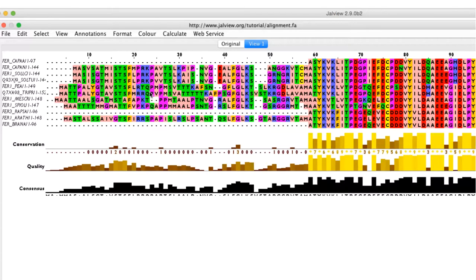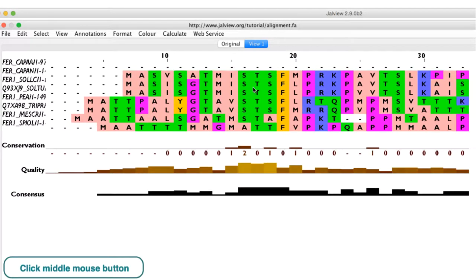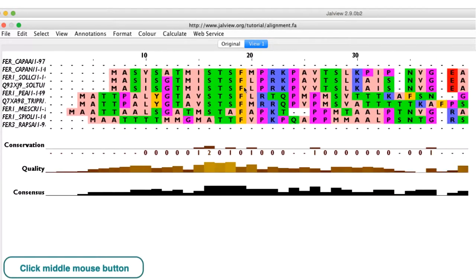A rapid way to change the font size and layout is to click the middle button and drag it across the alignment.